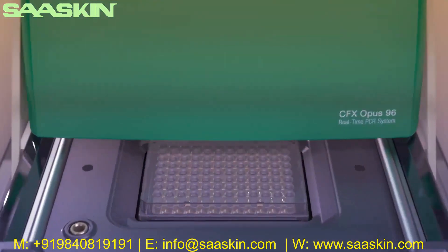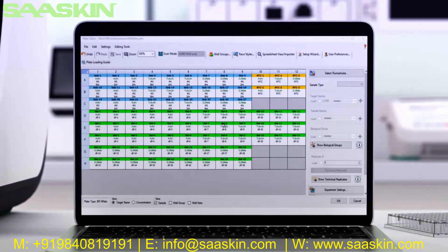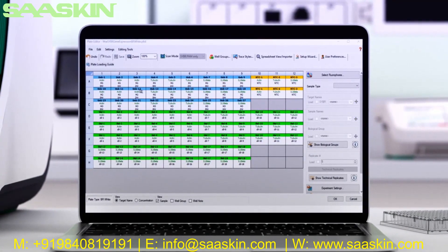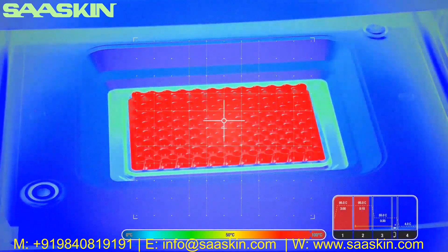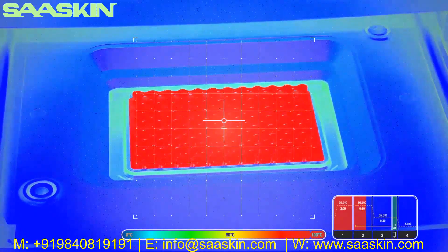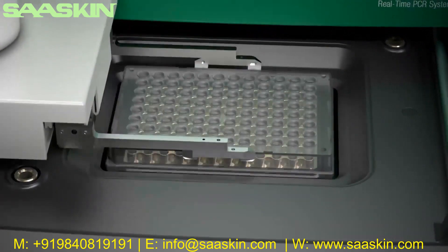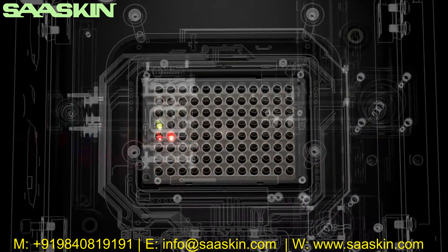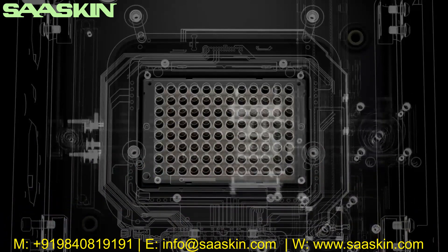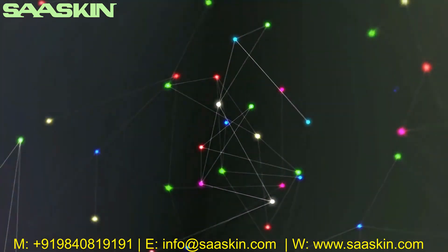For advanced data analysis, Bio-Rad's CFX Maestro software works seamlessly with CFX Opus systems. A simple visual interface lets you quickly create biological groups, technical replicates, set up standard curves, and generate publication-worthy graphics in real time. Bio-Rad re-envisioned their CFX Touch system block to produce its best thermal uniformity and accuracy, while retaining consumable compatibility. The robust optic shuttle is centered above each well and automatically collects all well data.